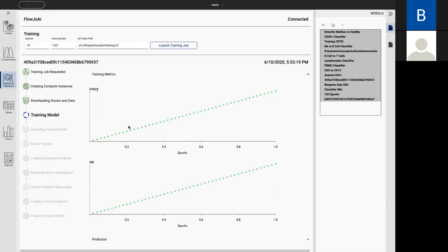What we'll see on our right-hand side in a few seconds is the update of each one of the epochs. And just to give a quick understanding of what an epoch is: an epoch in machine learning is used to refer to every time that you run your whole data set through a model.